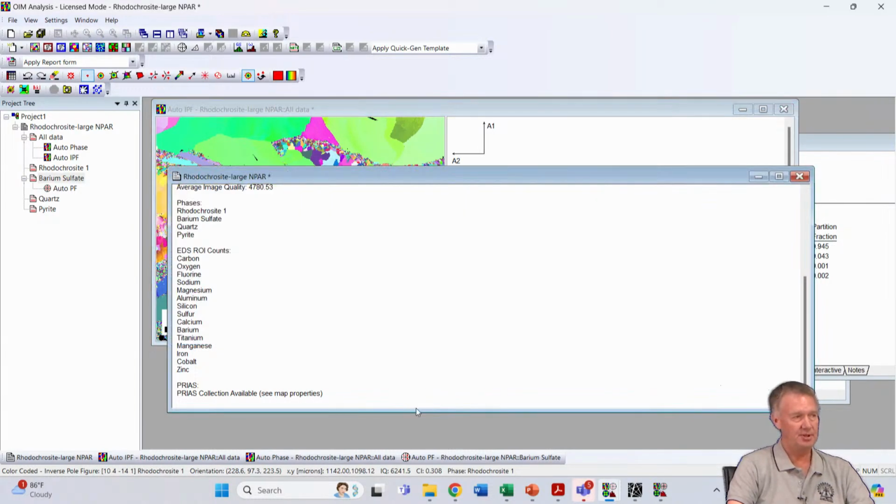Okay, anybody else? Any other questions? Is it possible to do EDS and EBSD simultaneously? Yes. Yes, it's called chi-scan, CHI, chi-scan.